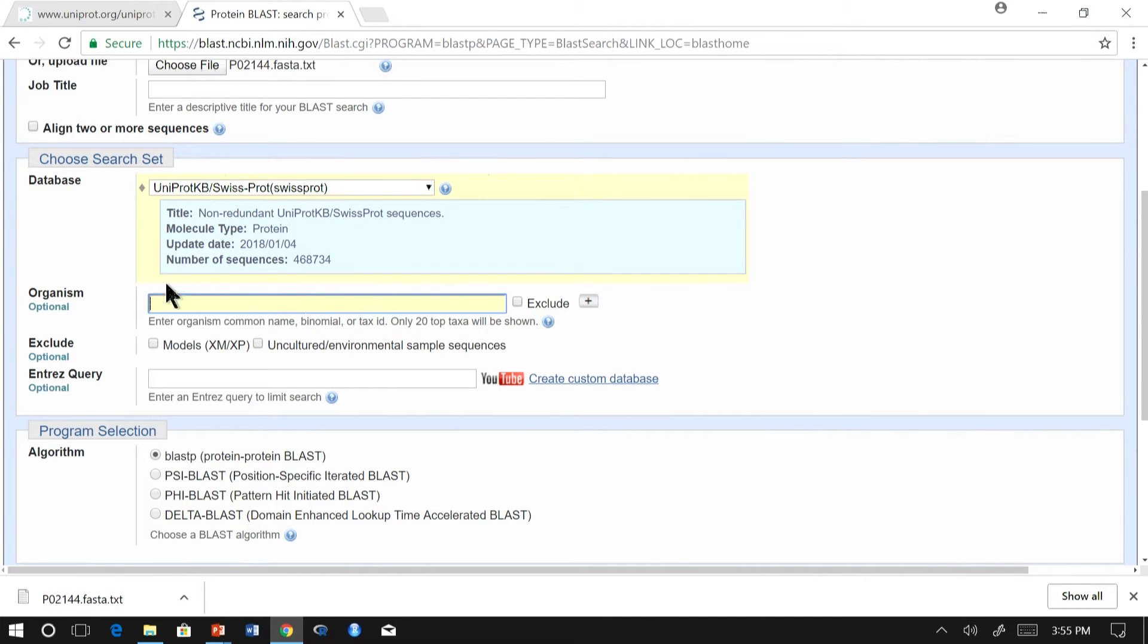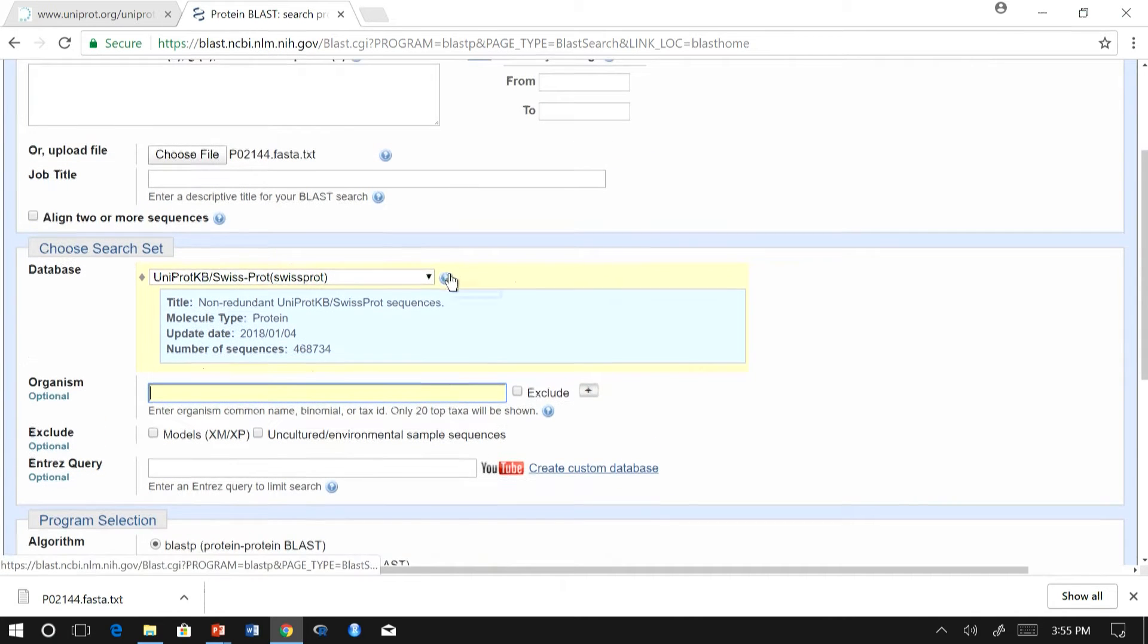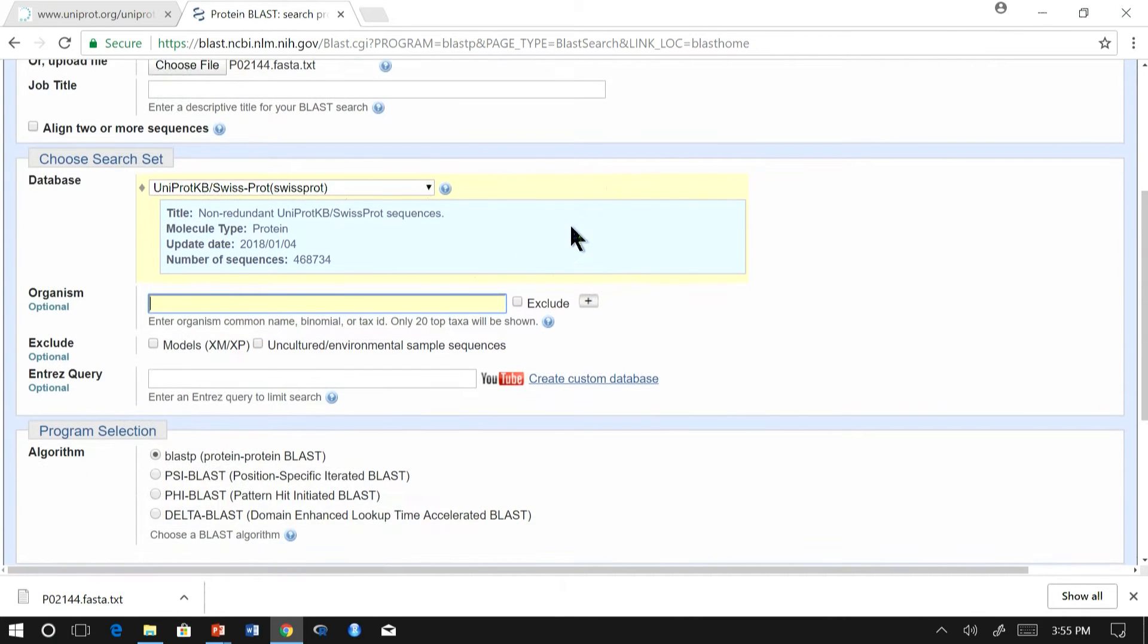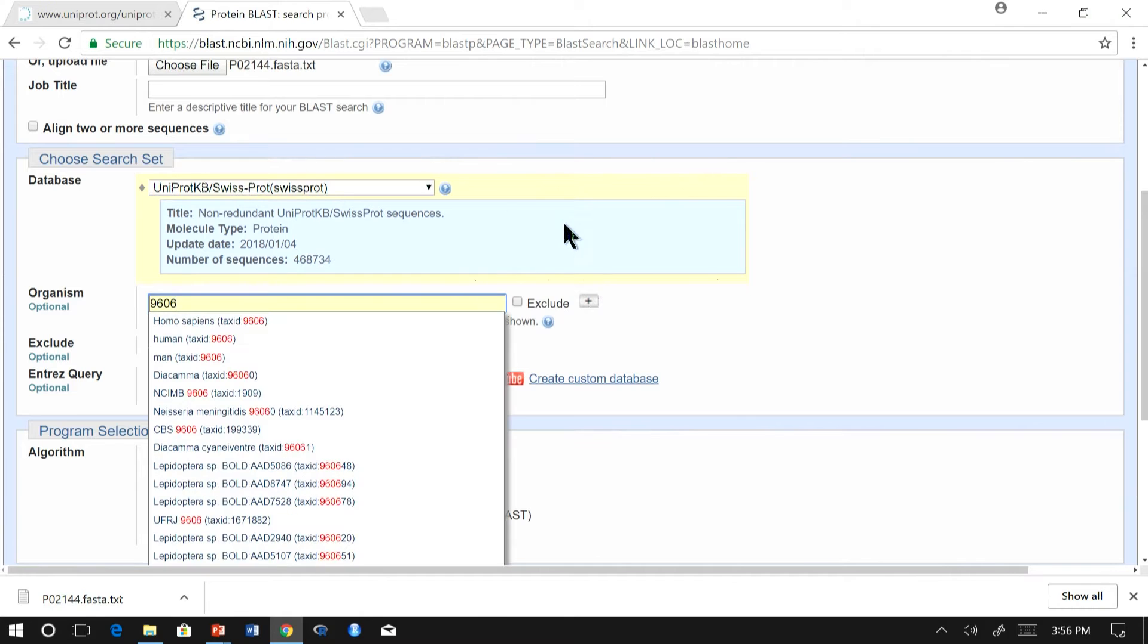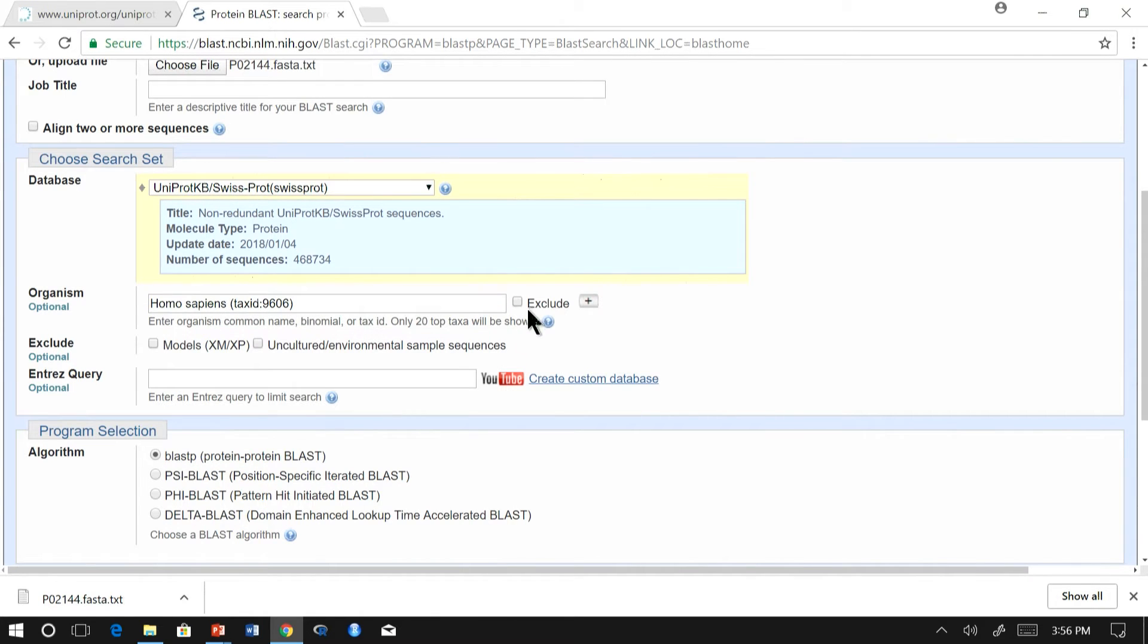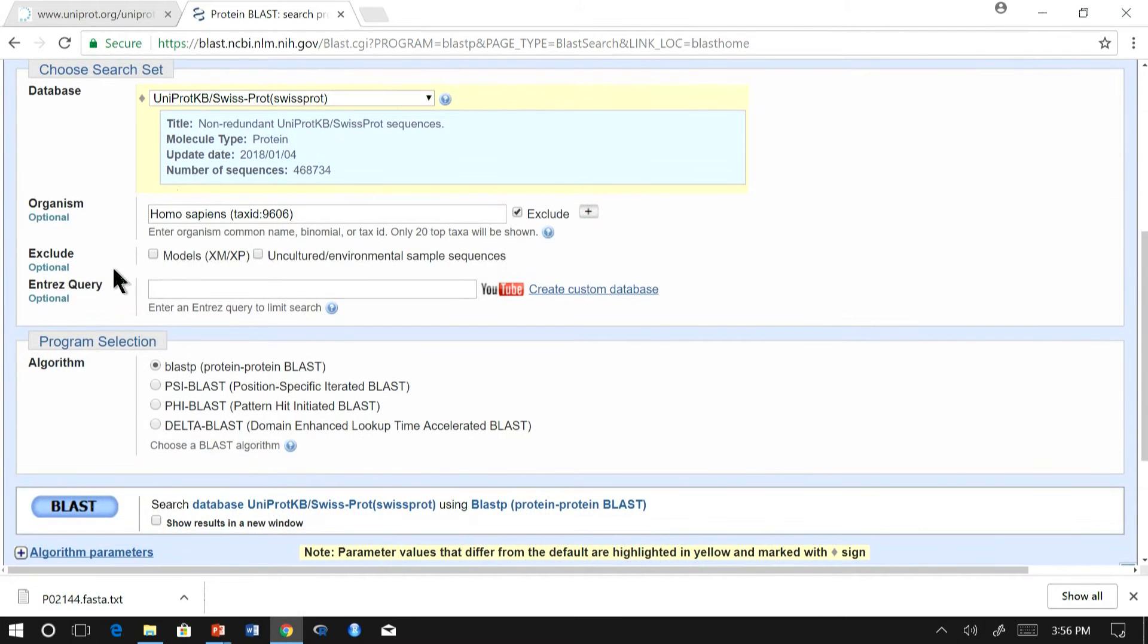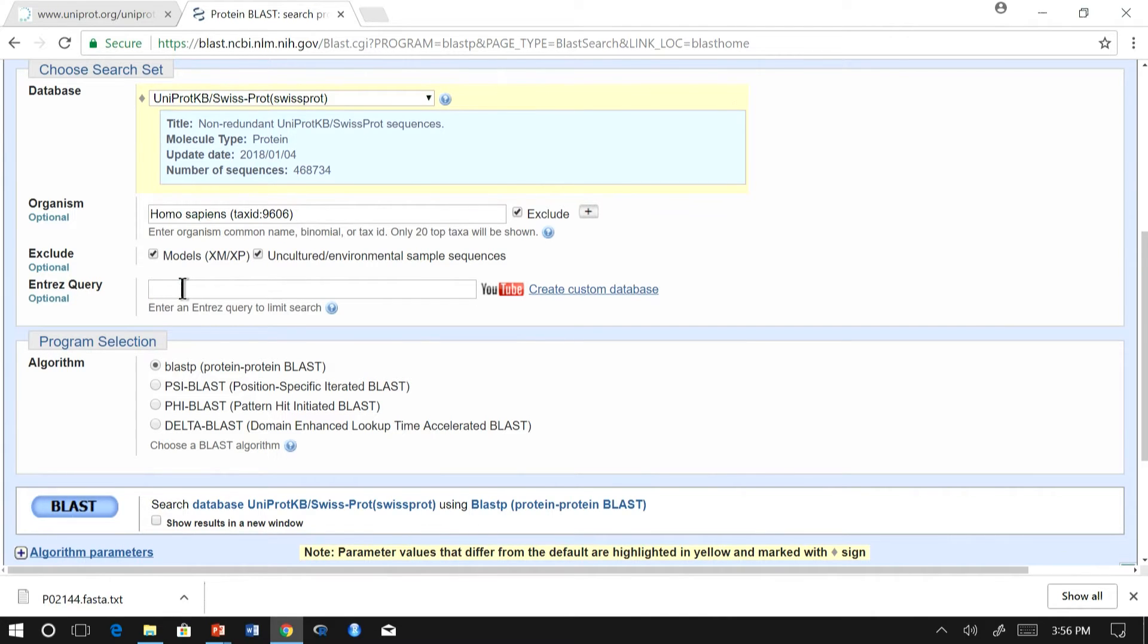Further, there are options to exclude or include organisms. For example, in our case we are taking human myoglobin. Let us exclude the human sequence. I am going to exclude the protein from humans. There are additional options to exclude and include. In case you want to filter the target database further, you can enter the query. For example, you can restrict the sequence length here.